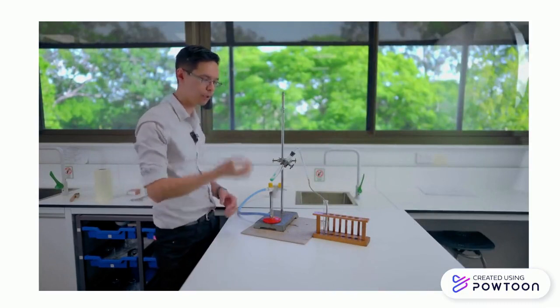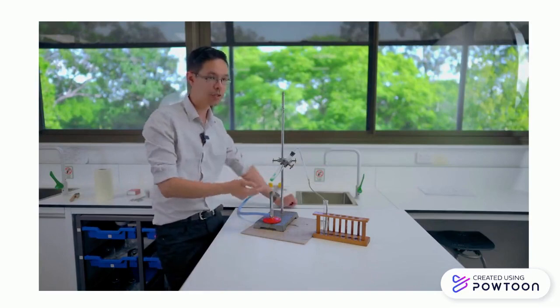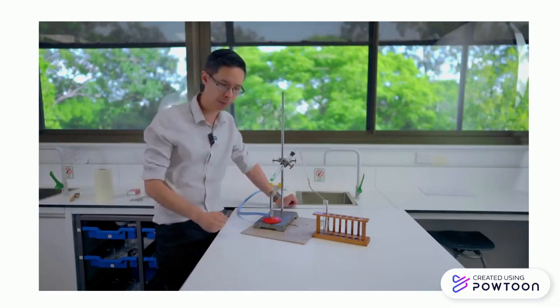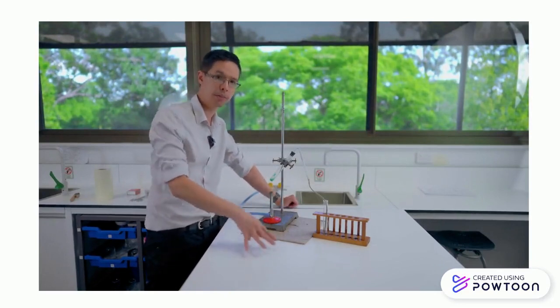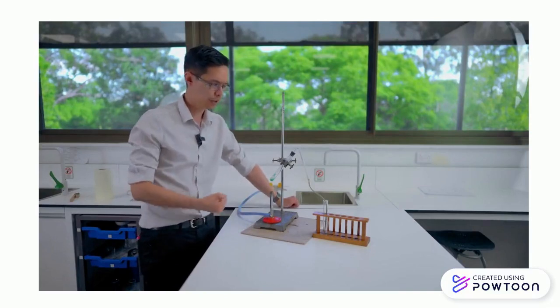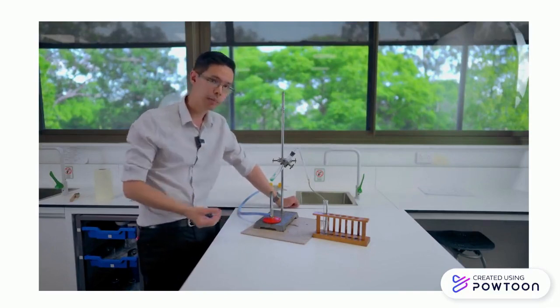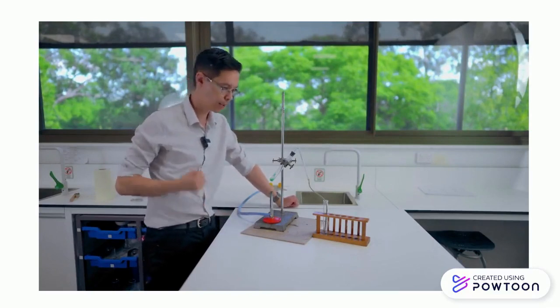and I think you'll see some very obvious ones here in this experiment. So you might be asking yourself, what's this whole setup down here? Well, this thing here should decompose. We start off with some copper atoms, some carbon atoms, and some oxygen atoms. Now, if it disassembles into smaller things, well, what things could you build out of that? So we're probably going to make carbon dioxide or carbon monoxide or something like that as a byproduct.